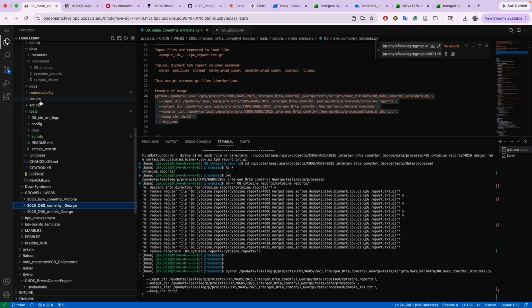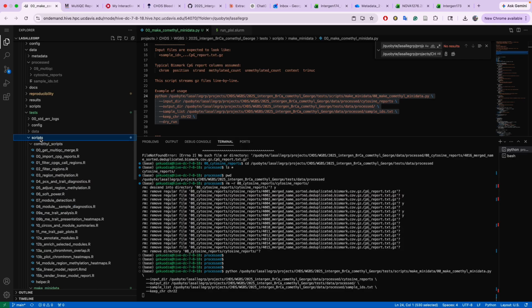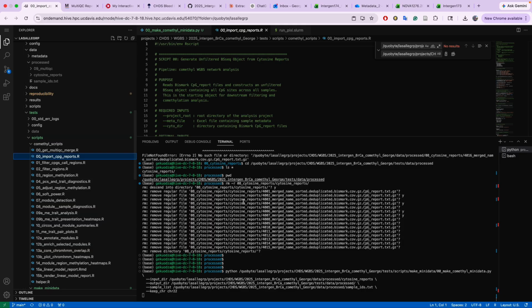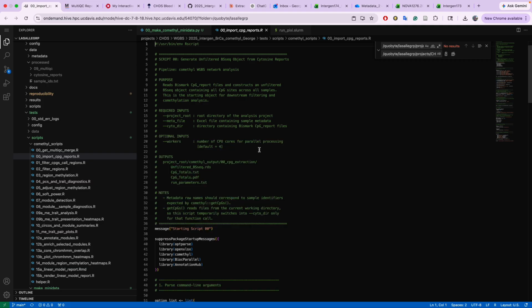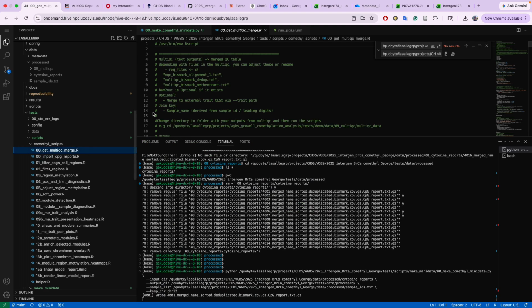All right, so I guess I'll go over some of the scripts then, because either way, you still gotta wait for this data to be generated. All right, so I'll start off with this first one. We're gonna skip the multi-QC for now.